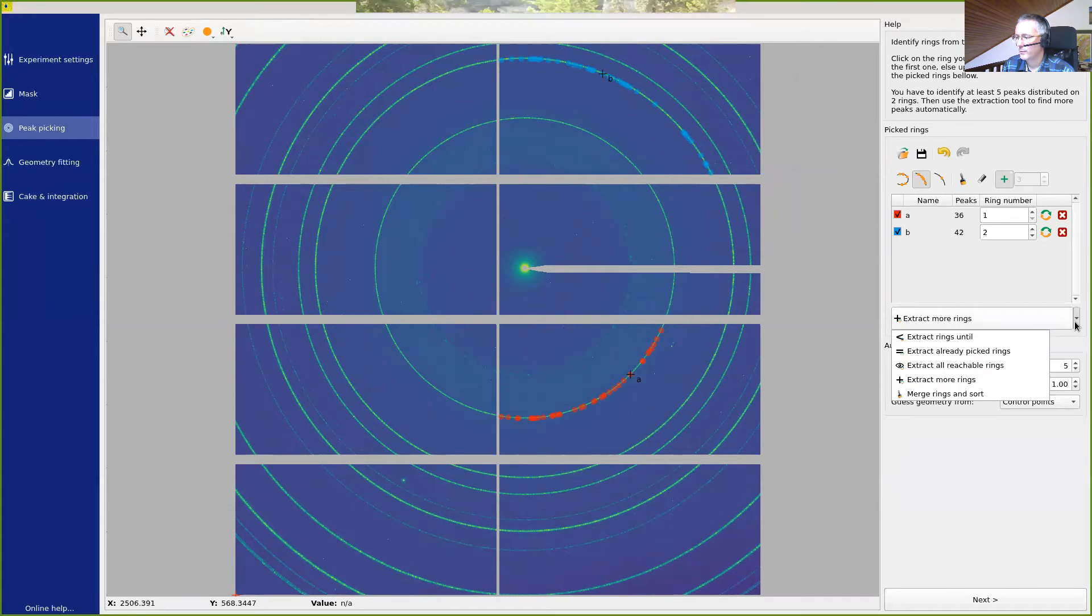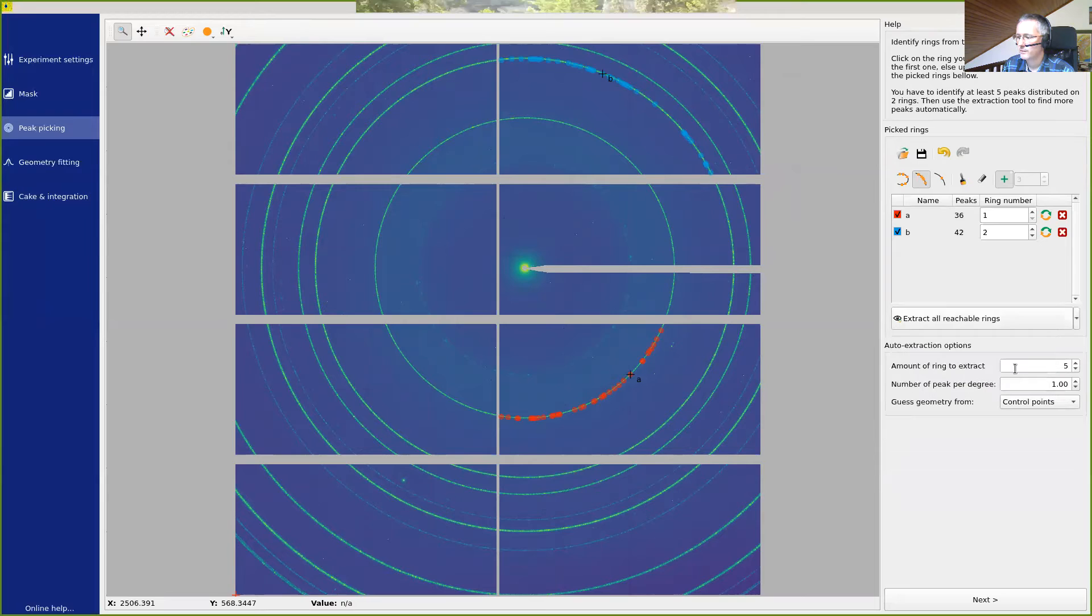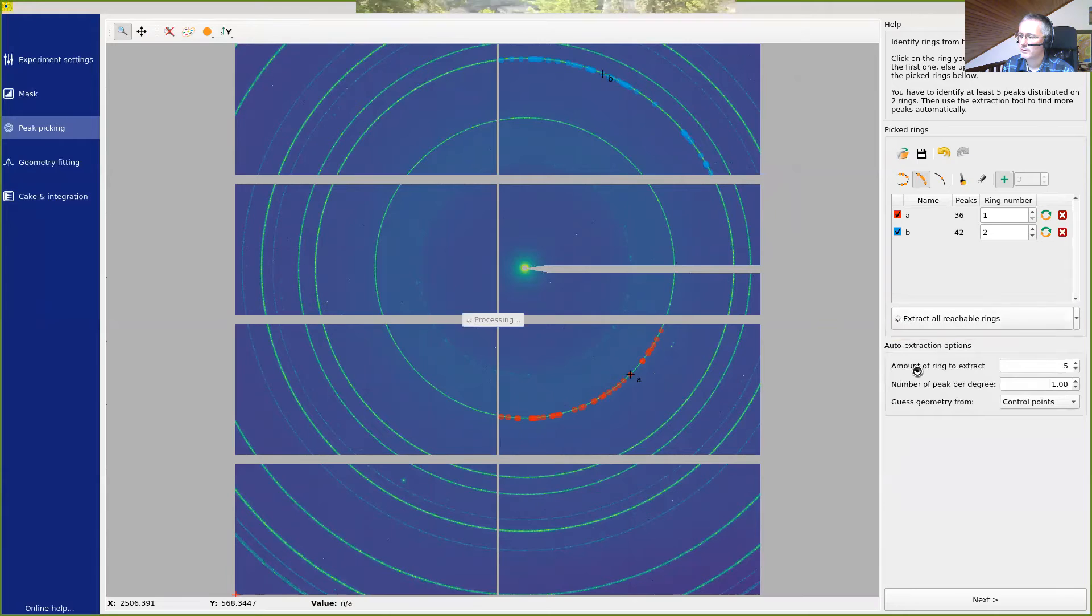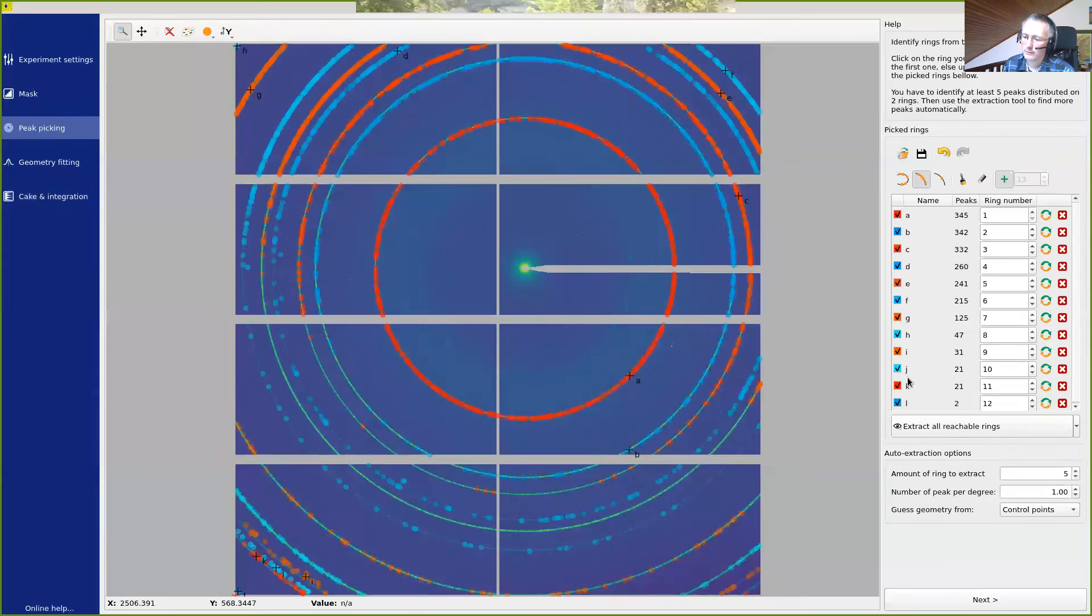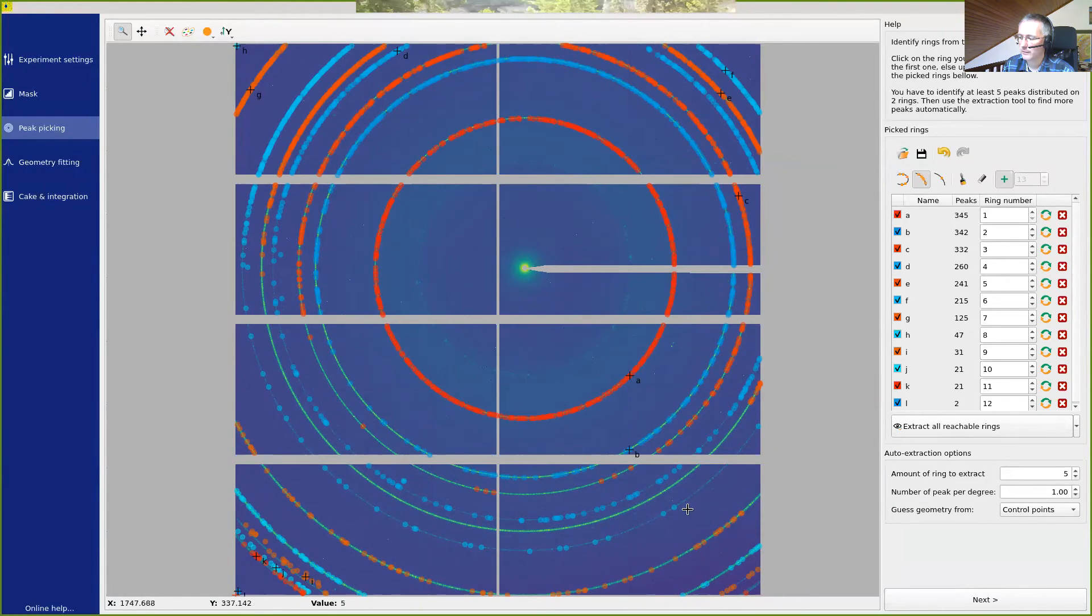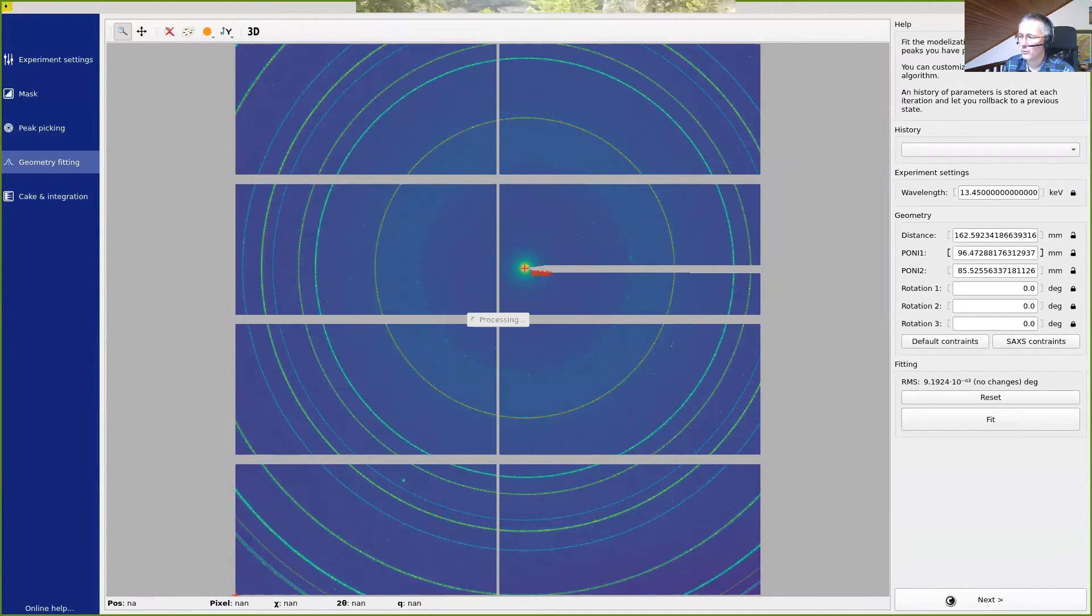So what we can do is go back to the peak picking and now extract all information available from this image. We can do this by extracting all reachable rings. This is obtained with this pulldown menu. Then just click on extract all reachable rings. And it will extract all peaks, which are now known, and select some points on them.